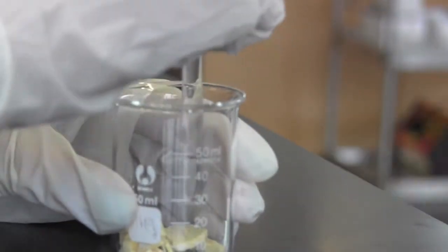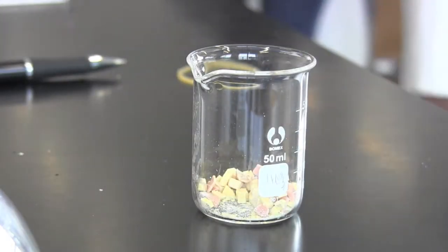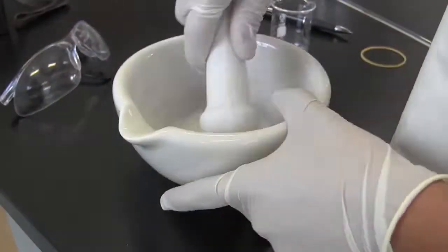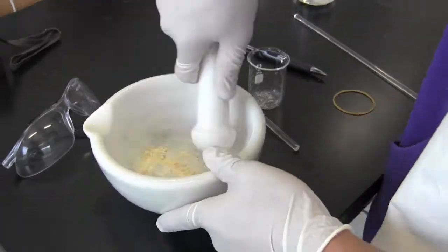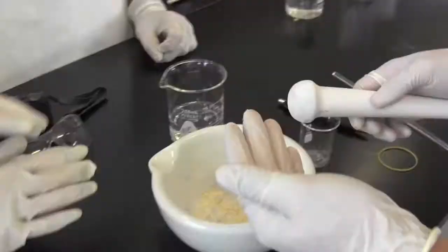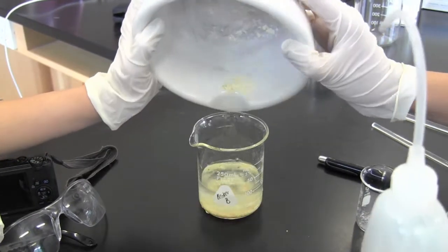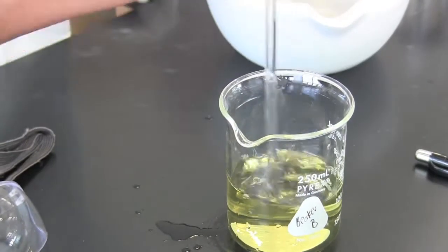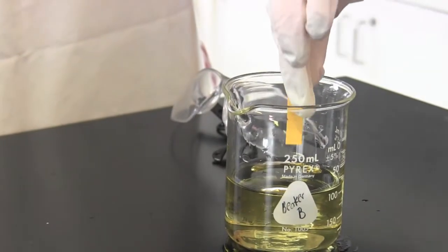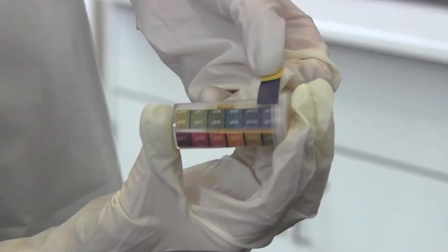Initially, we tried to use a stirring rod to crush the sodium sulfide, but it failed, so instead we used the mortar and pestle. We then added 100 milliliters of water with 5 grams of sodium sulfide and labeled it beaker B. We then mixed the sodium sulfide thoroughly to make sure that it completely dissolved in the water and tested the pH.